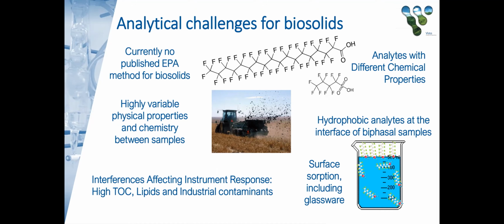PFAS are also hydrophobic, so they tend to partition between the solid and aqueous phase, which can make them harder to separate. And they sorb to solid surfaces often quite well, including the glassware during extraction.